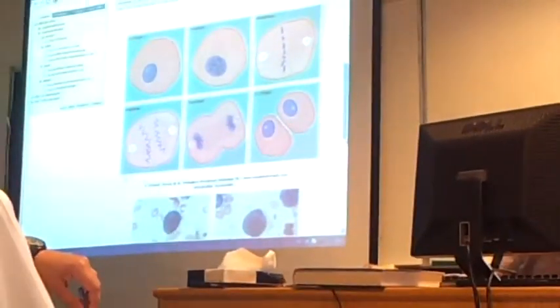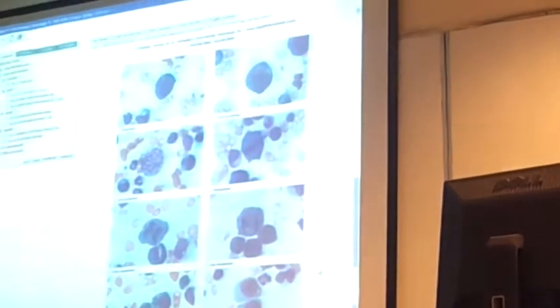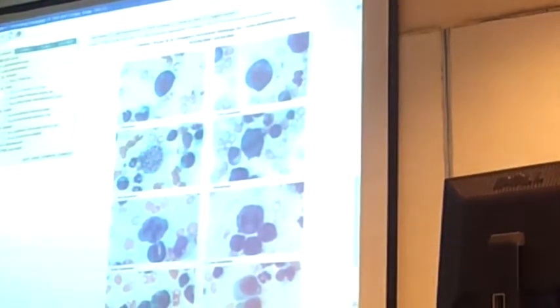Now let us see this in real pictures. On this slide you can see spindle formation - this is metaphase. You can see chromosomes attached on the spindle in a line. This line shows the spindle, so the identification is metaphase here.